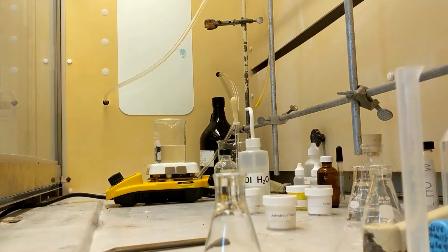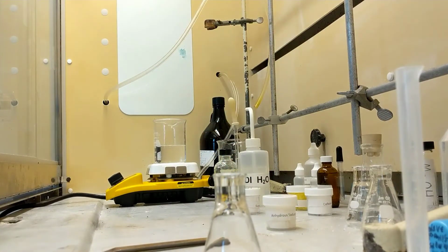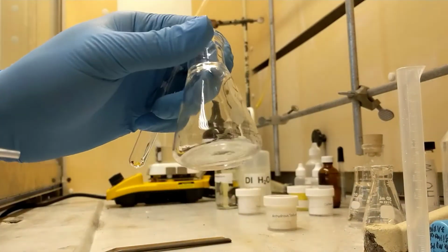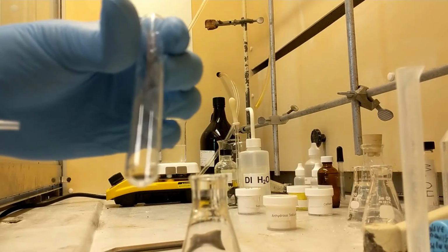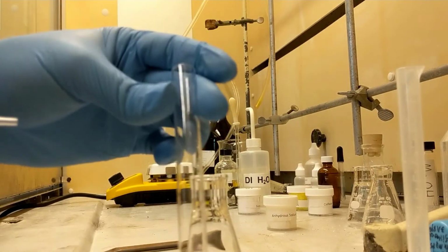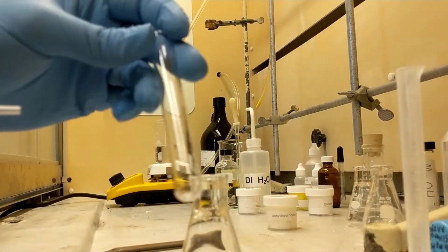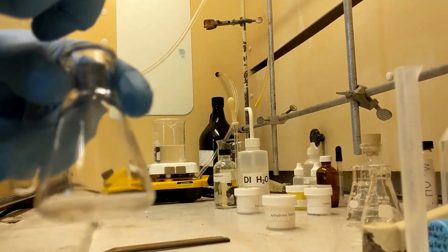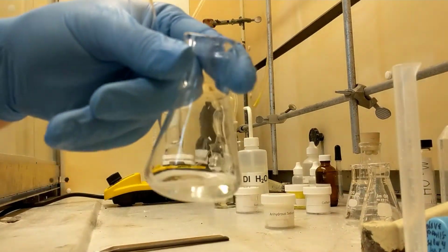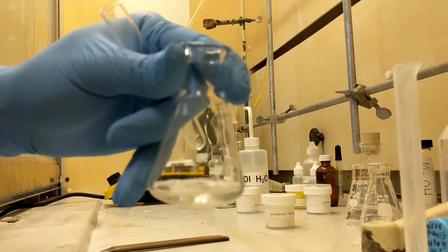Throw this Pasteur pipette out. Now, I'm going to pull this dry, clean methylene chloride out of this flask, put it into this test tube that's been pre-weighed, and I'm going to heat it and evaporate off all the methylene chloride. So same procedure as before. I'm going to just try to pull off all of this methylene chloride.